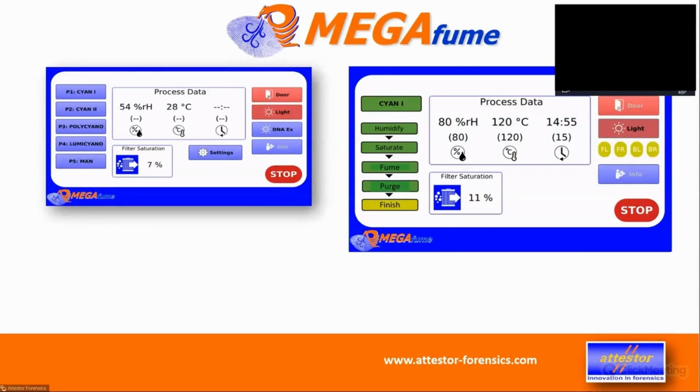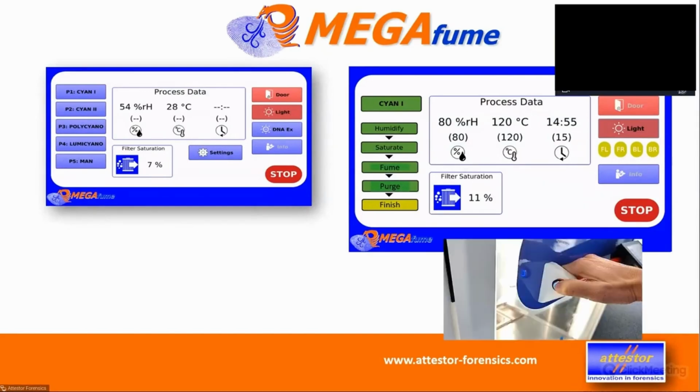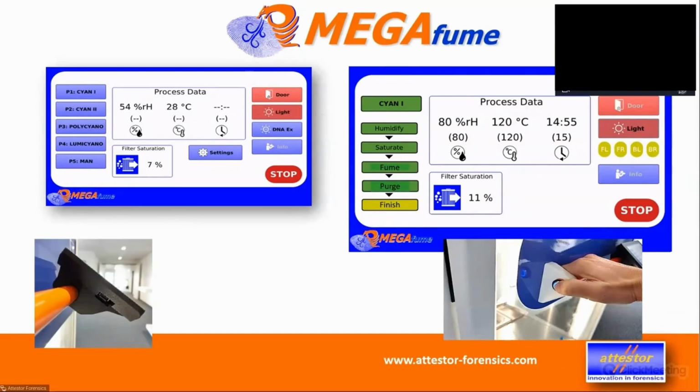So the process is really only finished when you as a user come back and say, stop, I'm finished now. That's probably also a bit of a difference to what we do. On the display, you see, probably very bad on that picture, but below the display there is a USB port, and our controller inside does have an integrated protocol logger. So every run is actually completely logged.